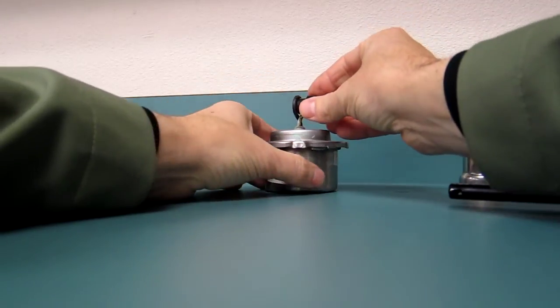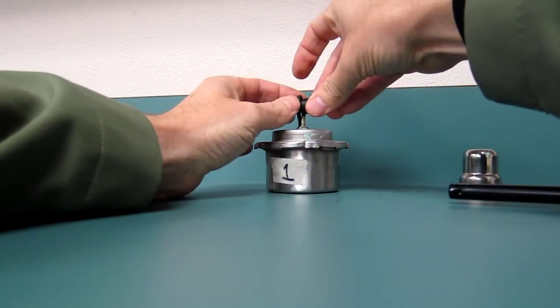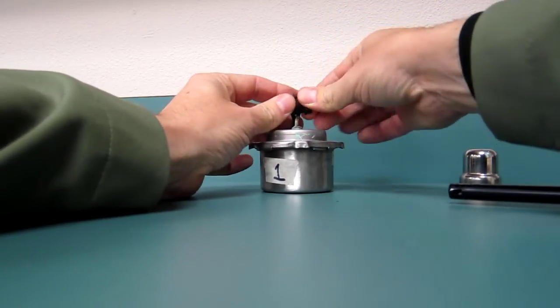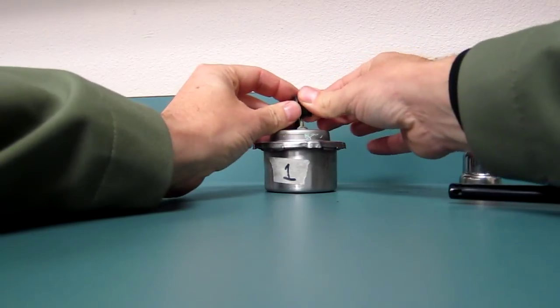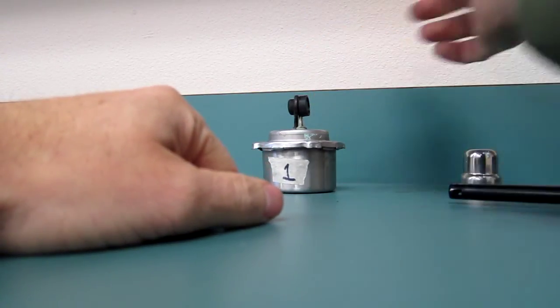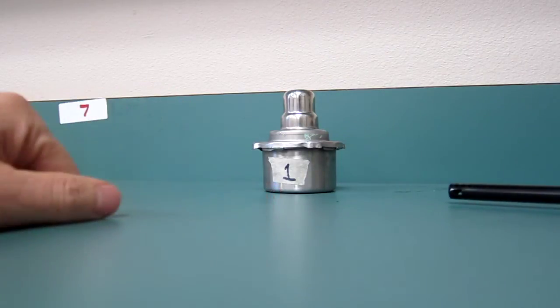And when you put the rubber stopper back in, don't push it hard. Just grab a hold of here and make sure that once it's cool, you got to make sure that's cool though. You don't push too hard on the metal because it will bend it. Okay, and that keeps the alcohol from evaporating, and so does the lid that goes back on. Again, safety-wise, no transporting without goggles and aprons on.